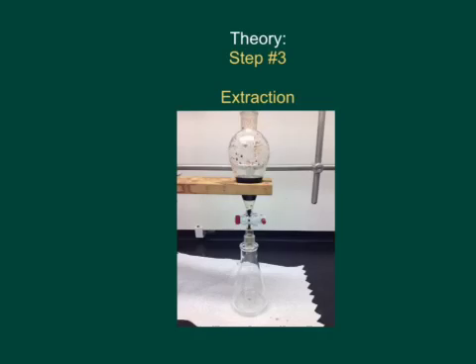Again, the tannins broke down into a form inside the top layer where they will be insoluble in methylene chloride. So all we're collecting is the methylene chloride with the caffeine inside this Erlenmeyer flask right here. This process is done a total of 5 times to extract the most amount of caffeine as possible from the liquid above.